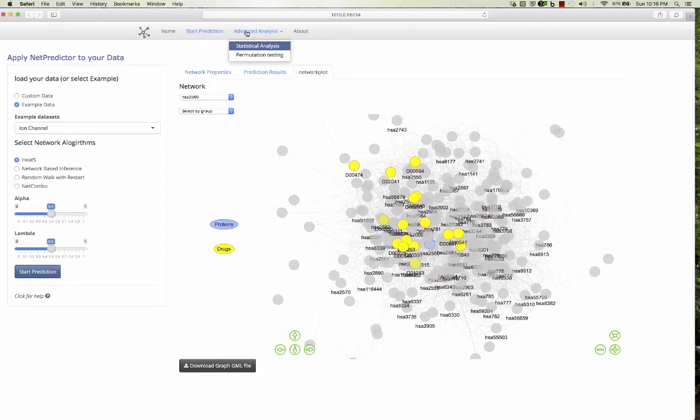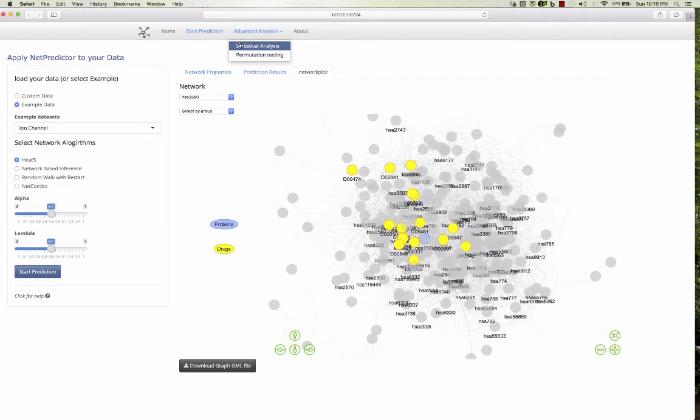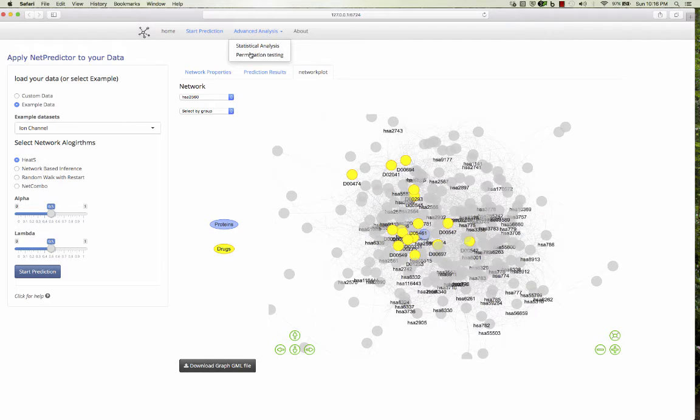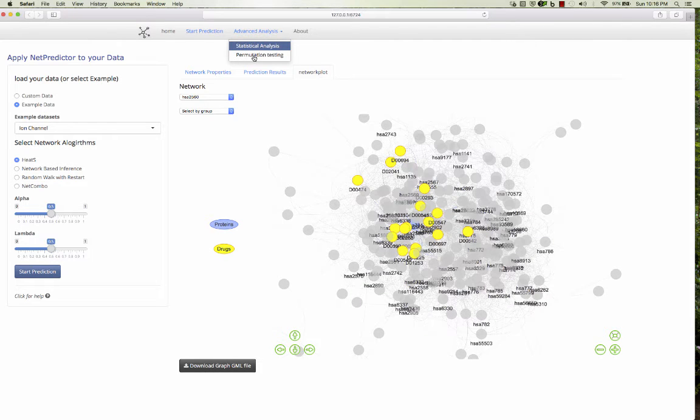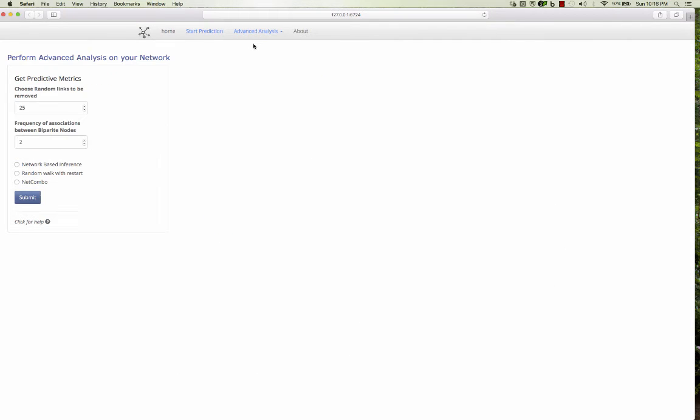Let me go to the advanced analysis tab. It has these two tabs, the statistical analysis and permutation testing. So once you load your data, now you want to do advanced analysis.